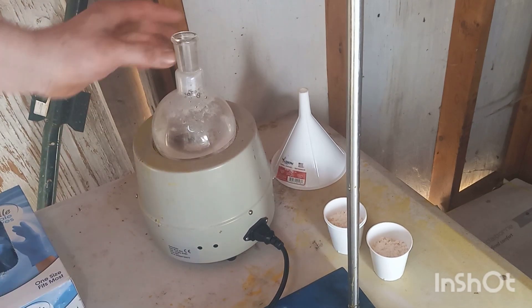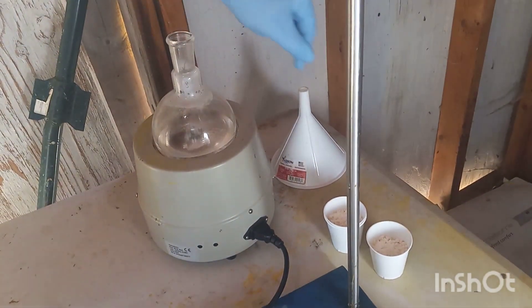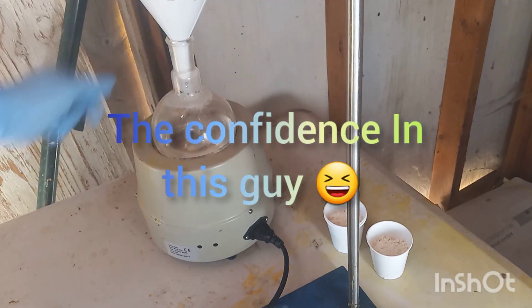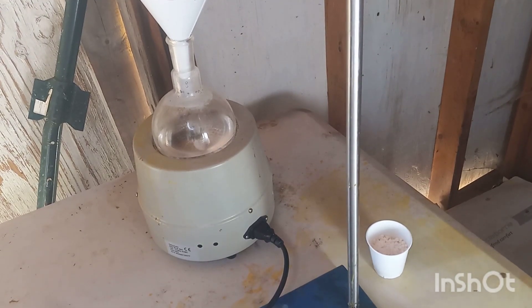So this is our reaction mixture and let's get her started. Let's just add a little and see what happens.